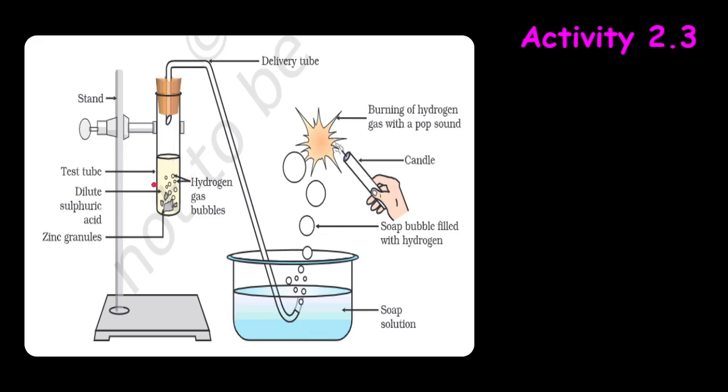So first of all, we are going to take 5 ml of sulfuric acid in the test tube and add a few pieces of zinc granules to it. Then we will add zinc granules.